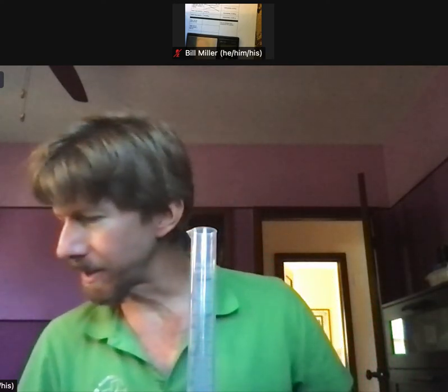Oops, almost forgot about this portion of the lab. This is experiment four. We're going to make a solution that we're going to use in next week's lab. And so we're on B, preparing a solution of known concentration, something that we've done before, but we're going to do it using our new substance today.